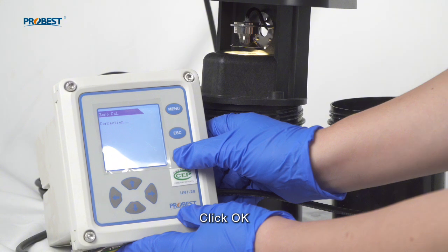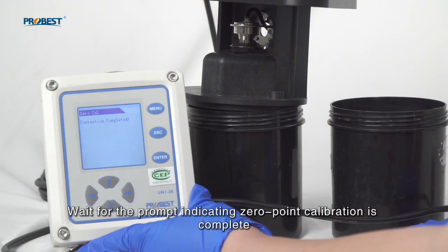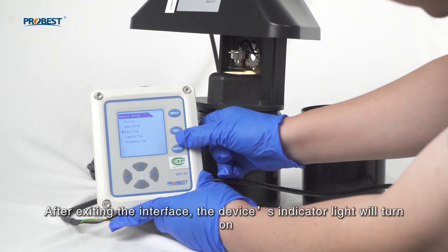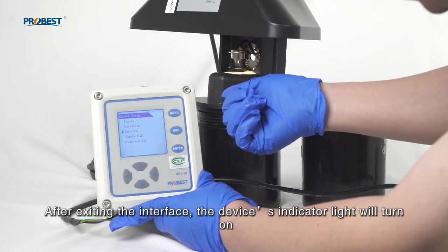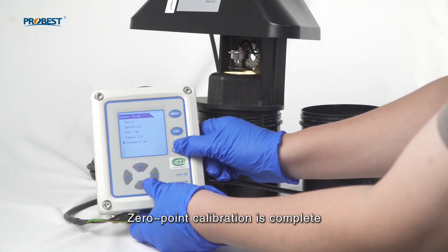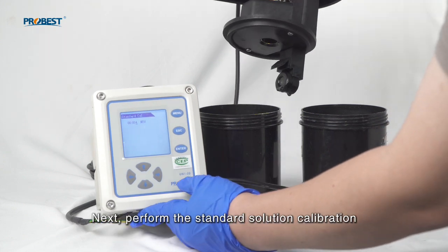Click OK. Wait for the prompt indicating 0-point calibration is complete. Exit the interface. After exiting the interface, the device's indicator light will turn on. 0-point calibration is complete. Next, perform the standard solution calibration.